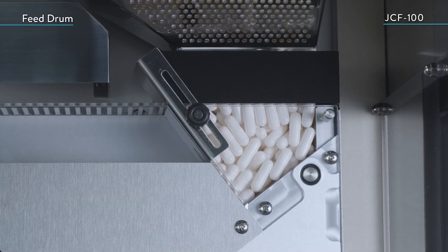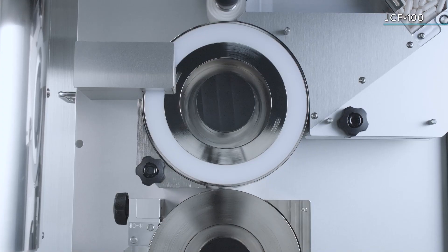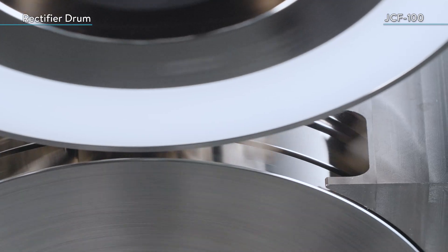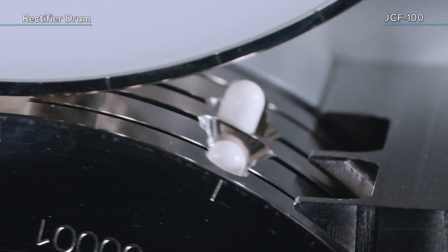The capsules are sent out from the supply drum, orientated by the rectifier drum, and then transferred to the transfer drum.